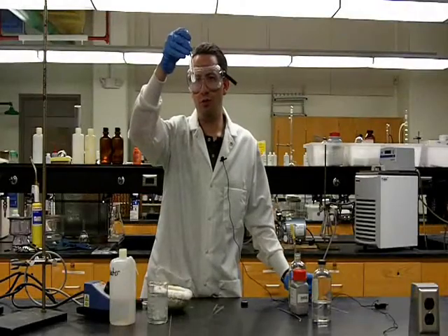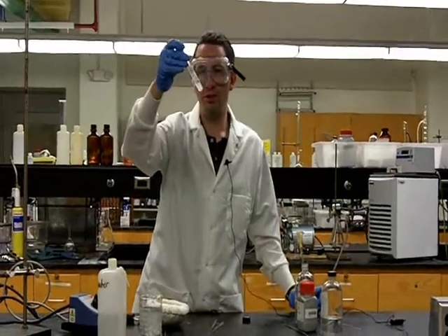Now that we've allowed our solution to cool to room temperature, we can already see that some of the fluorene has started to crystallize out.